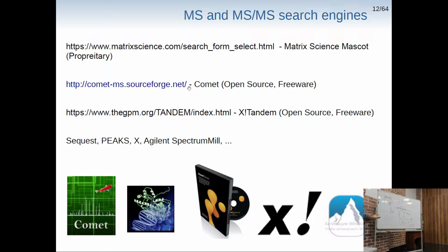With Andromeda, I've got more comparable data than with most of the others. I don't know how they did it. They called it predictive fragmentation something. I haven't gone deep enough to understand what they've done, but their algorithm is working a little bit better than the others. But all of them are good enough, actually.